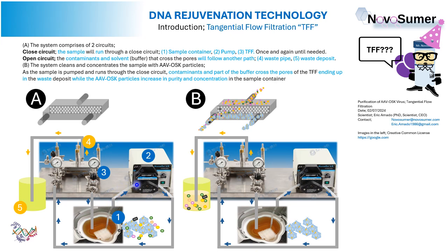Let's go together through the circuit again. Sample container, pump, TFF device, and again. This is a closed circuit. What happened regarding the other circuit?